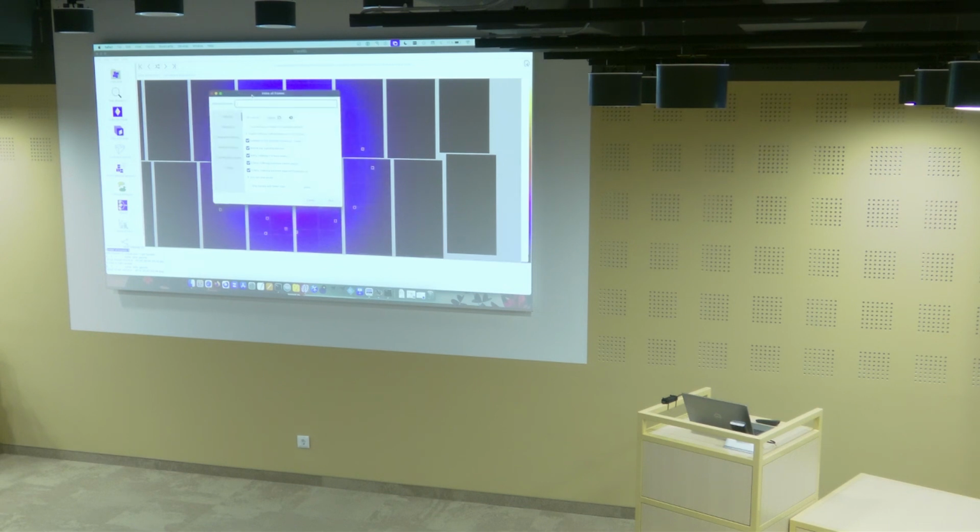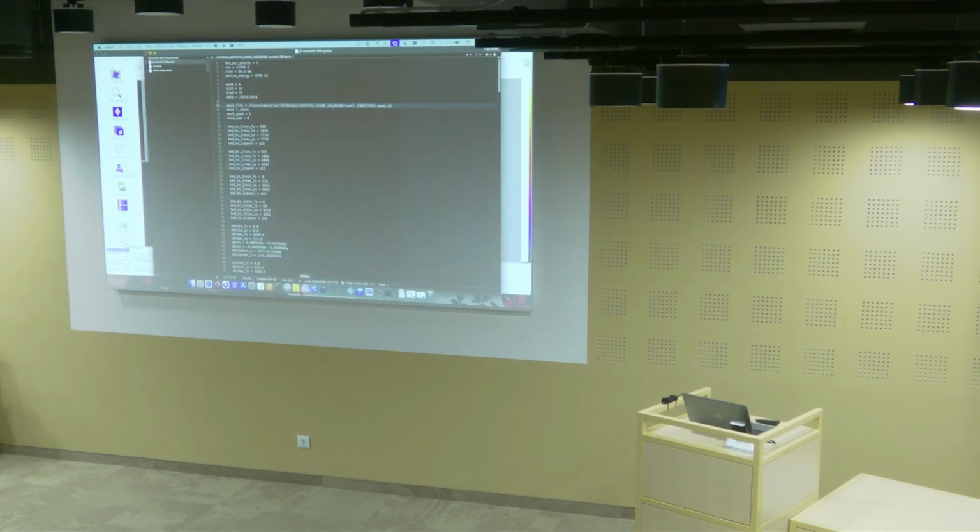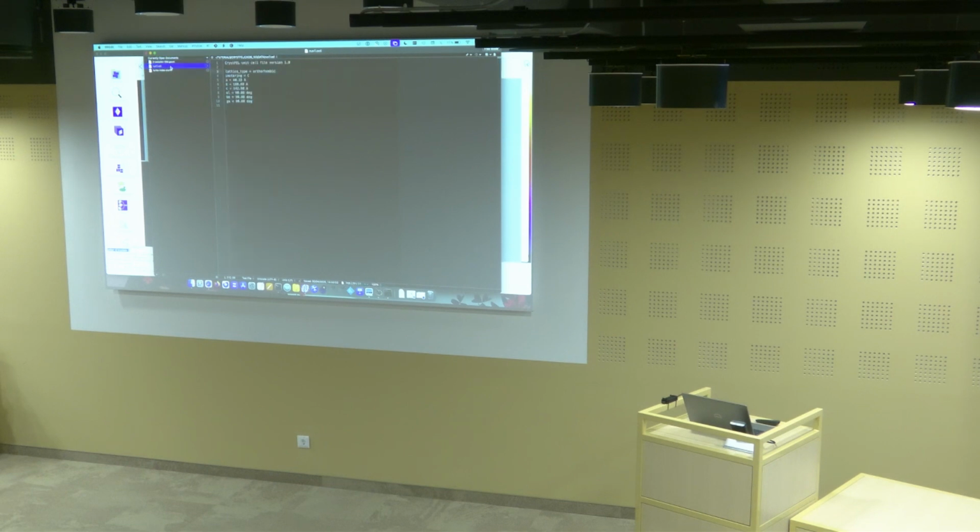And now we have to give it a name for an output directory. So I call it run1. And we're going to give it cell information. I opened it. So we're going to give it unit cell information. So that's this crystal unit cell file.